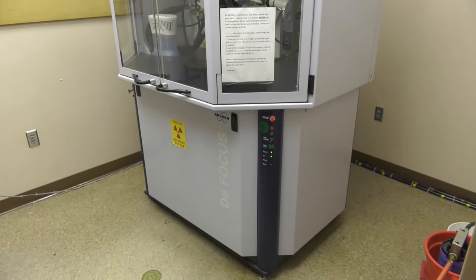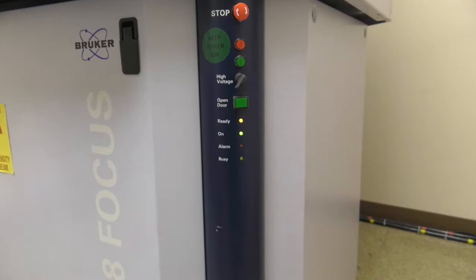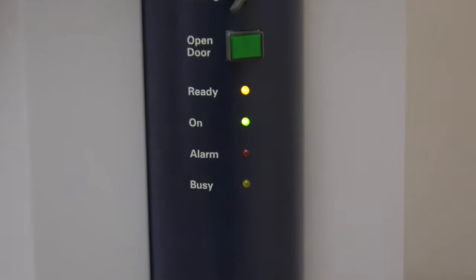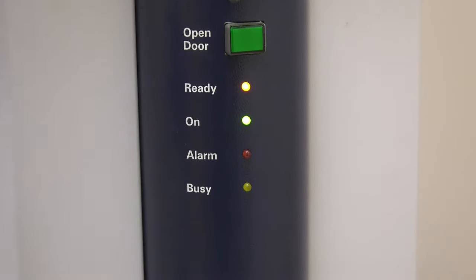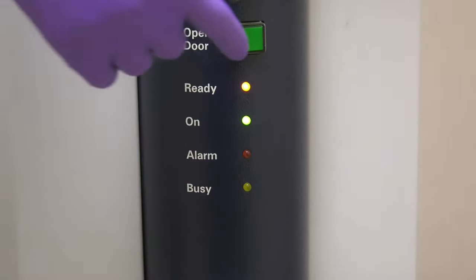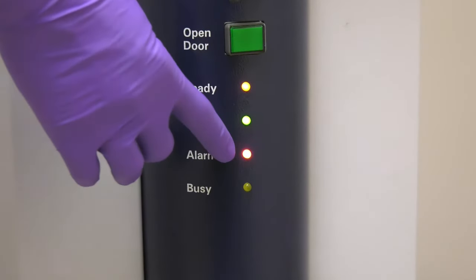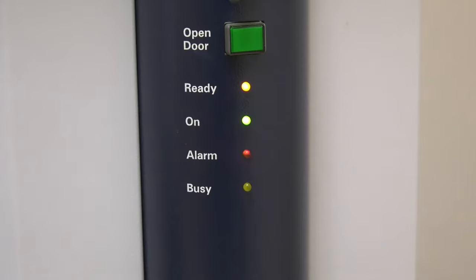Upon entering the XRD room, the user should take notice of the operational lights on the side of the instrument. The ready and on lights should be illuminated, while the alarm and busy lights should be off. To unlock the doors, the user presses the open door button. The alarm light will blink while the doors remain unlocked.